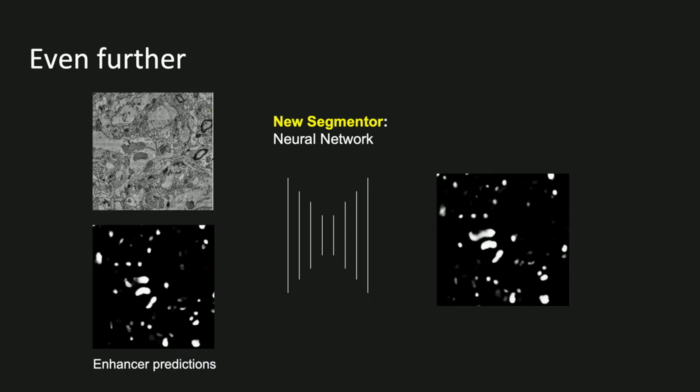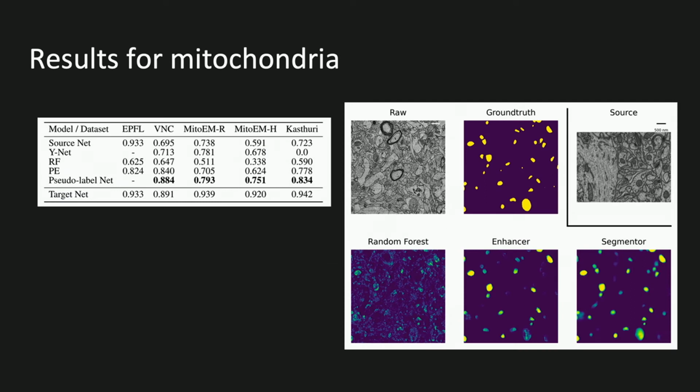And this part, going from the enhancer to segmenter, the part that I just showed here, doesn't require any, let's say, intelligence in running it, because we already know where all these hyperparameters have to be set. It's just a question of submitting a job, and then it comes back. But you don't have to really tune anything. You don't have to deeply understand what is happening. You don't have to manually switch things around. Yeah, so this is where it is now.